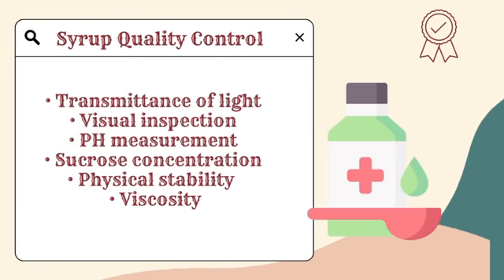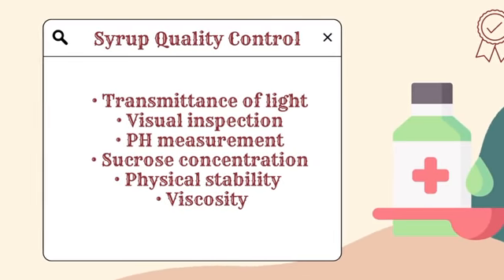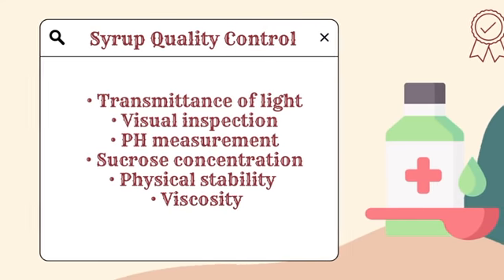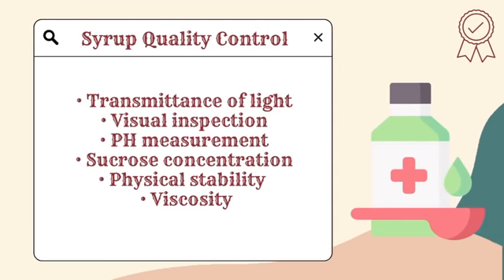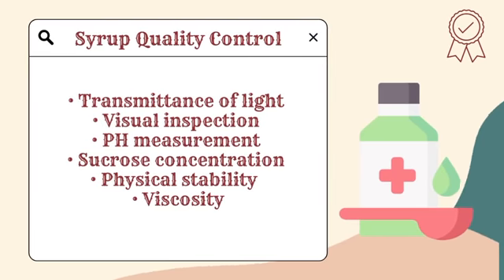Quality control tests for syrup: transmittance of light, visual inspection, pH measurement, sucrose concentration, physical stability of syrup, viscosity.